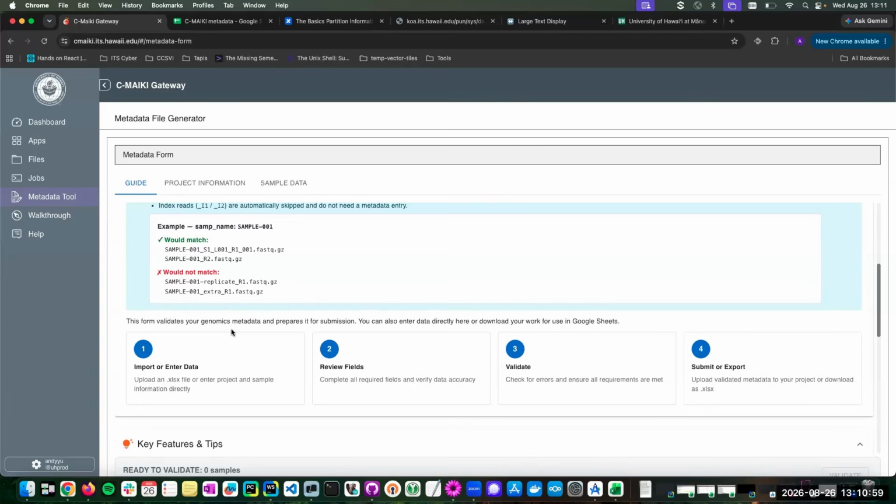And a lot of times we build Nextera libraries, but with the same primer. The target is the same, but the way the library is built is different. And so, getting into the question, I think your 16S pipeline is strictly built for EMP libraries because those trimming parameters are going to be specific for the EMP sequencing primers that actually don't sequence the amplification primers themselves. Is that true?